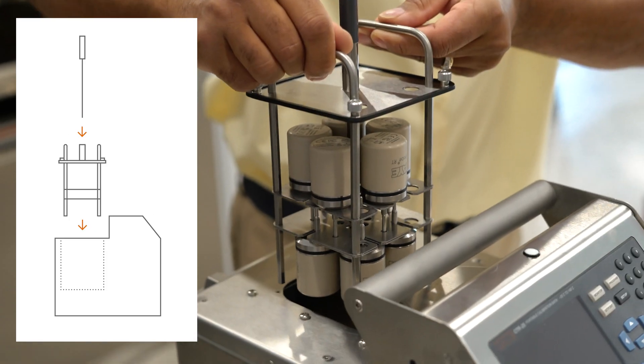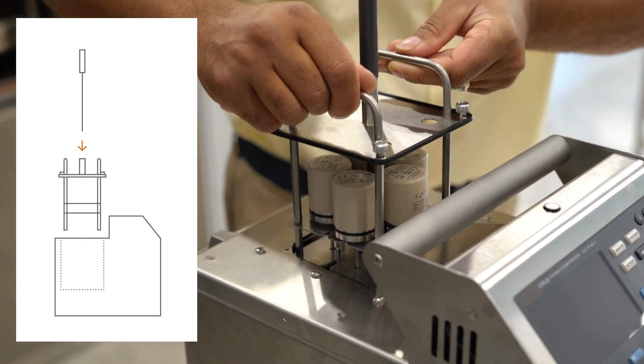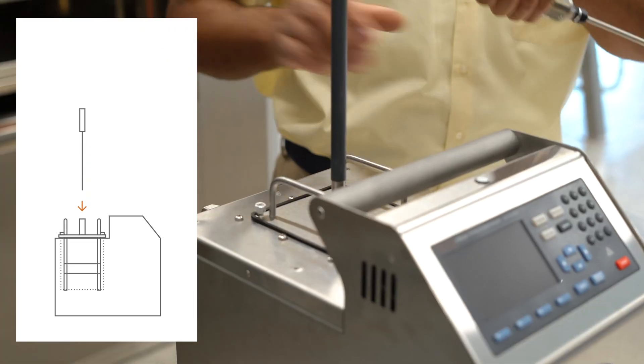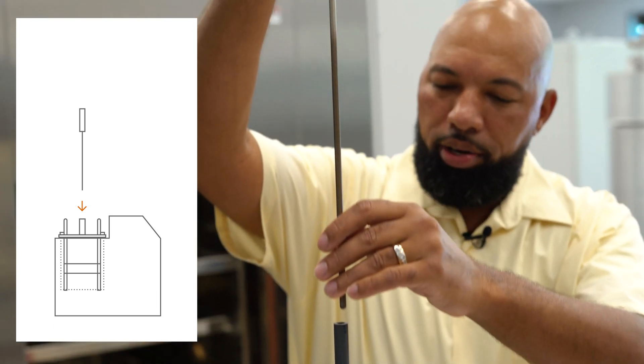Once your loggers are inside the tray, you would then submerge the loggers into the oil. Once inserted in the oil, you would then insert your IRTD.